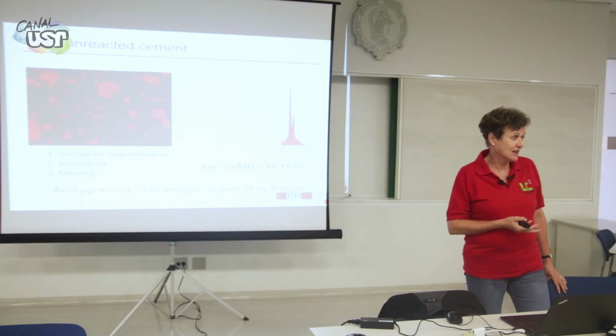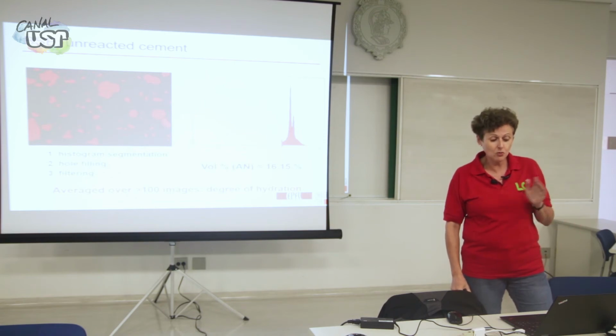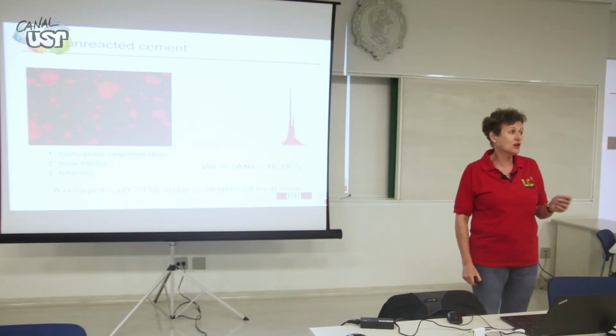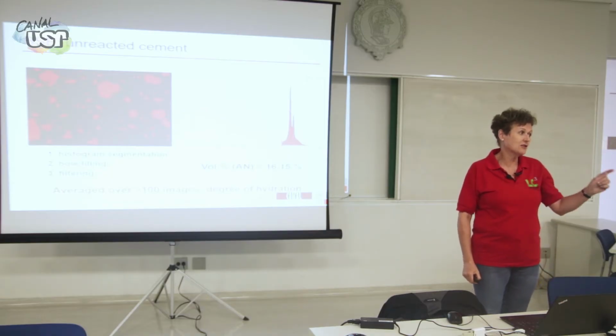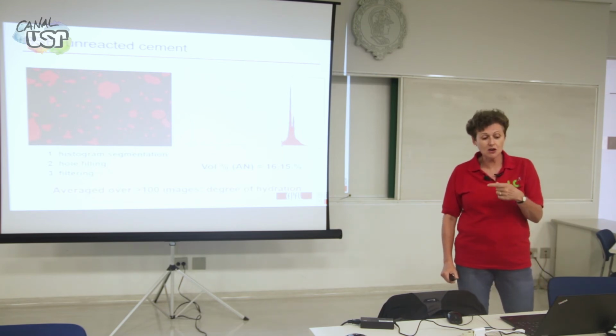It's not as accurate as Rietveld analysis, because Rietveld analysis works very well on the anhydrous phase. So if you want to measure the degree of hydration, this is not the recommended method. But it has the advantage you can do this in a concrete, whereas you can't use Rietveld in a concrete. So if you want to look at the degree of hydration of cement in a concrete, you can use this method. And then if you have amorphous SCMs, it's also good. Well, if they're large. So it works very well for slag.